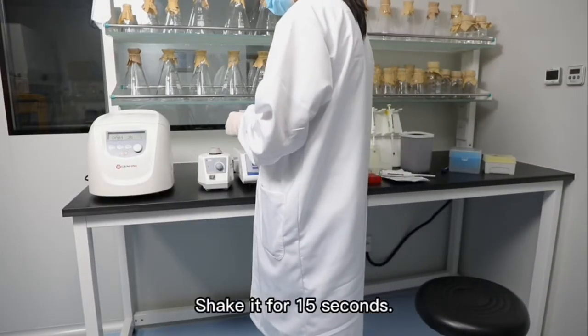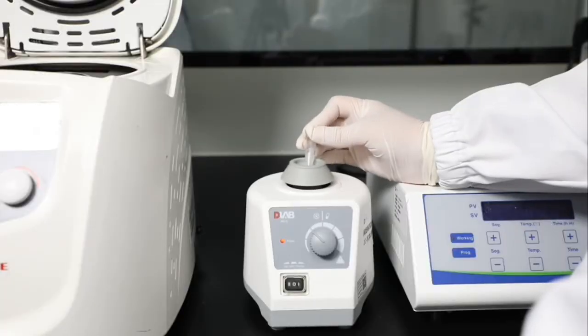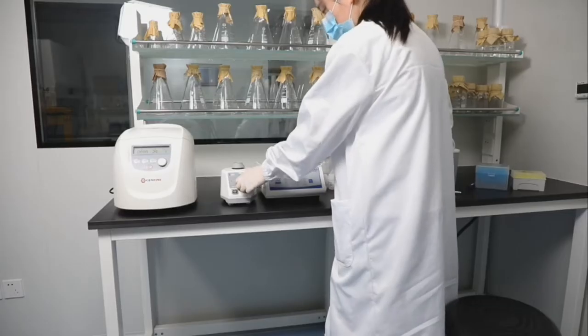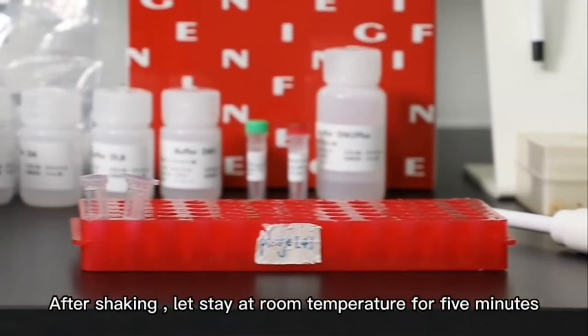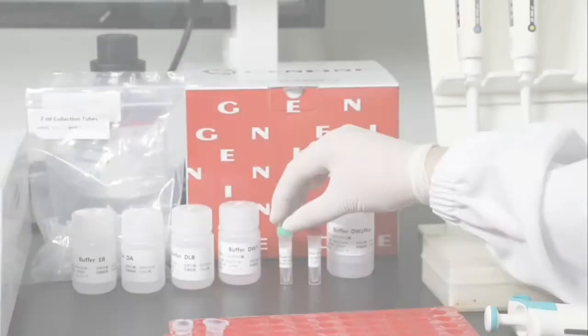Shake it for 15 seconds. After shaking, let it stay at room temperature for 5 minutes.